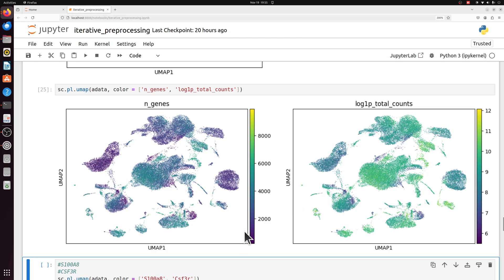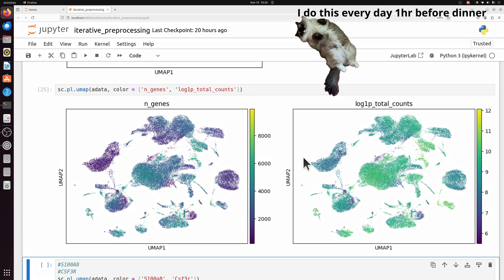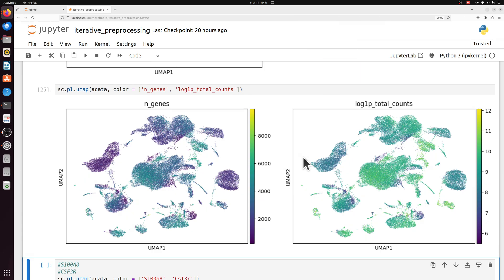We have some of these that only have a few hundred genes. And then we have some, a lot actually, that are in the range of like 4,000 to 6,000. So when we have this large dynamic range, that can affect these distribution-based methods for determining if something is an outlier. Because some cells just naturally express fewer genes, like neutrophils.